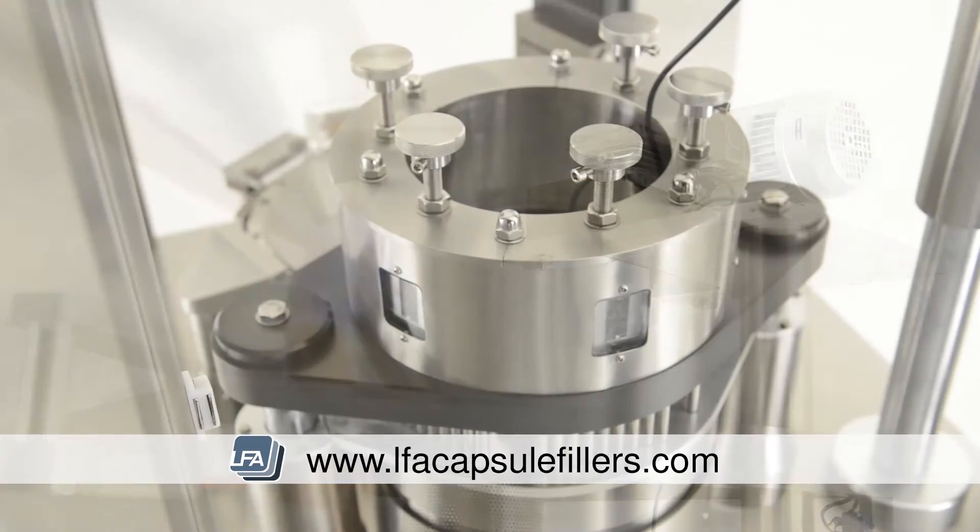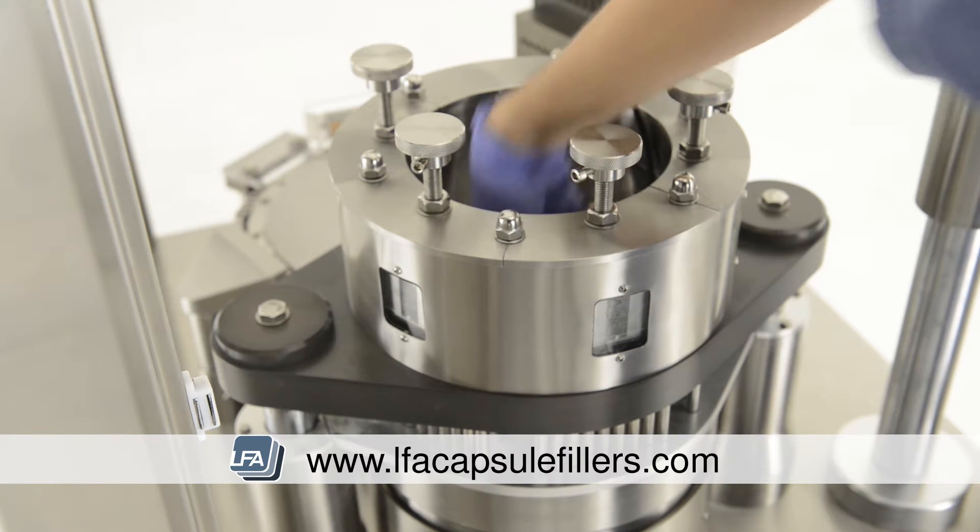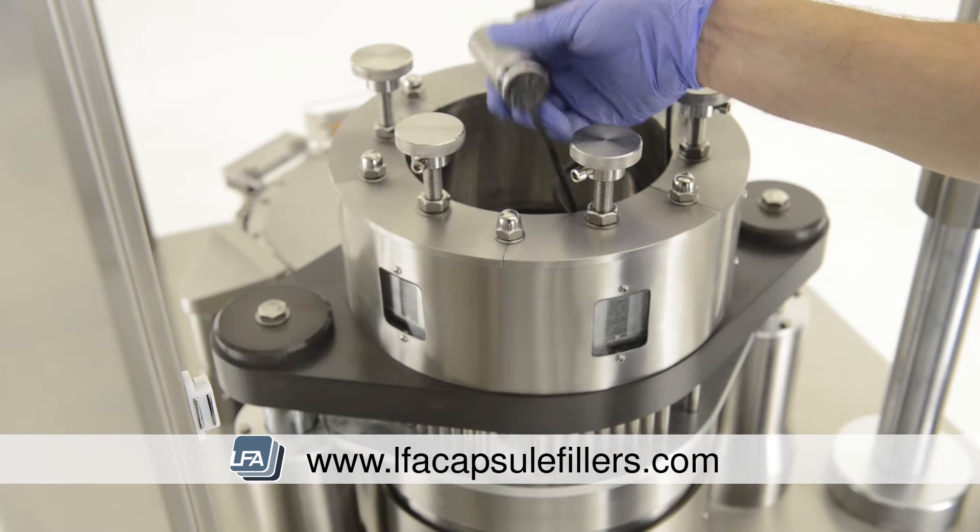We suggest two people to do this. The next task is removing the sensor. Follow the cable down the centre of the tamping turret and pull out the sensor and place it to one side.